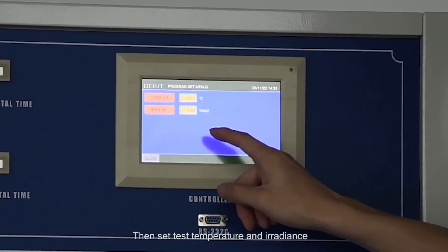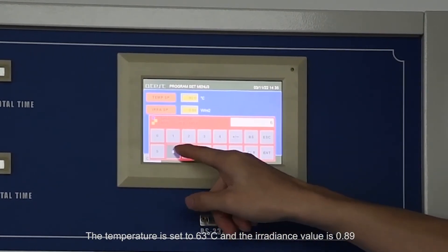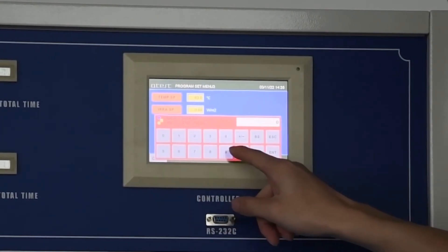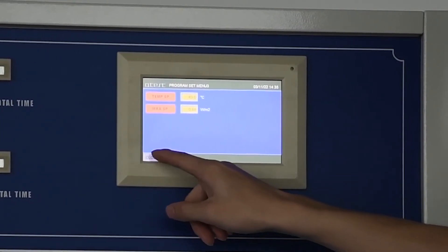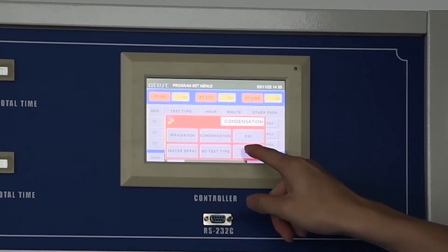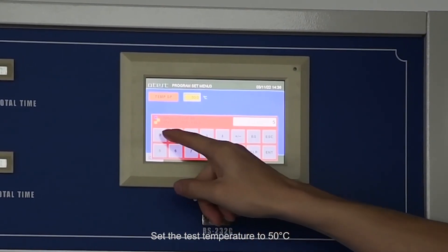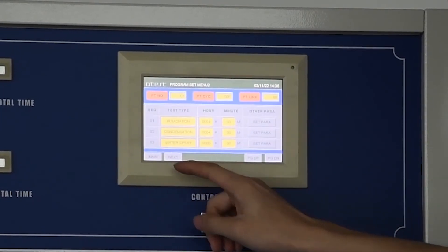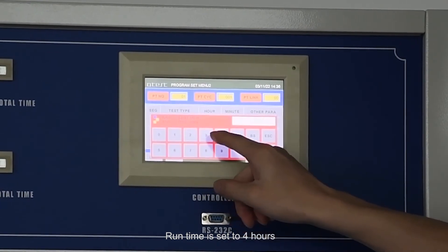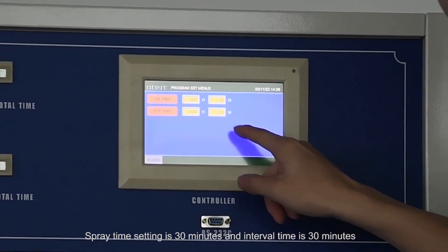For the first stage, select irradiation mode or condensation mode with a runtime of four hours. Set the test temperature to 63 degrees centigrade and set the irradiance. For the second stage, select condensation mode with a runtime of four hours and set the test temperature to 50 degrees centigrade. For the third stage, select spray mode with a runtime of four hours; spray time is set to 30 minutes and interval time is 30 minutes.